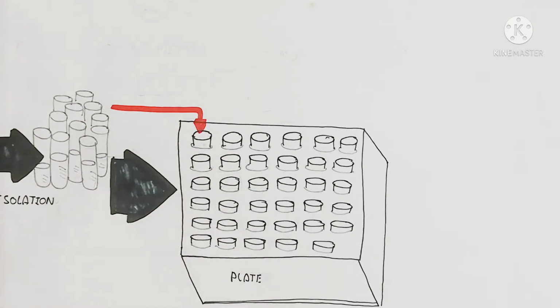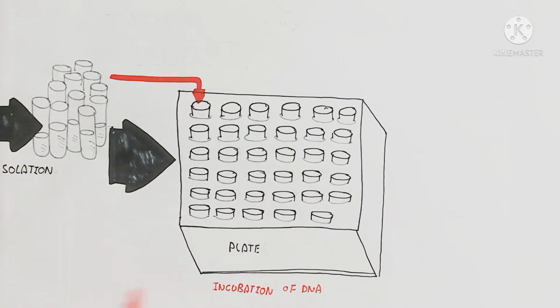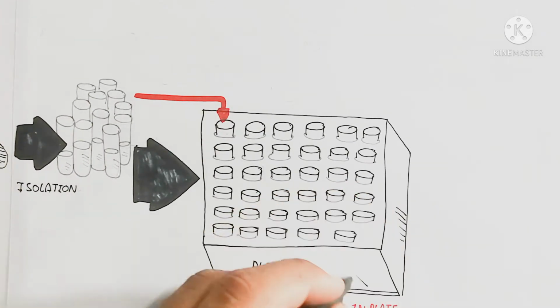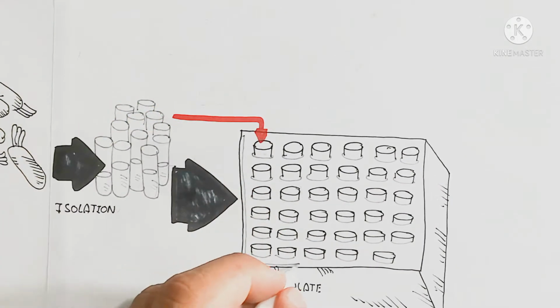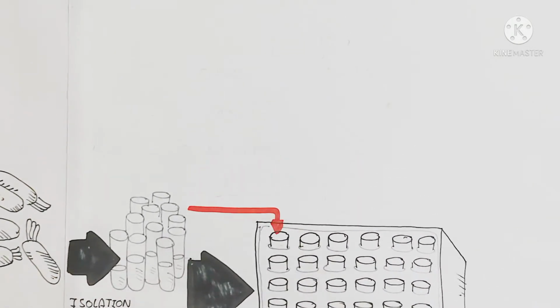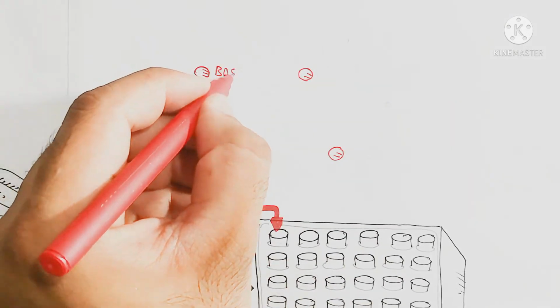First are the bases, and second is the DNA polymerase enzyme, which is used for the polymerization of the nucleotides into DNA, while the DNA primer is also used. On the other hand, one more thing is the modified DNA base or terminator.